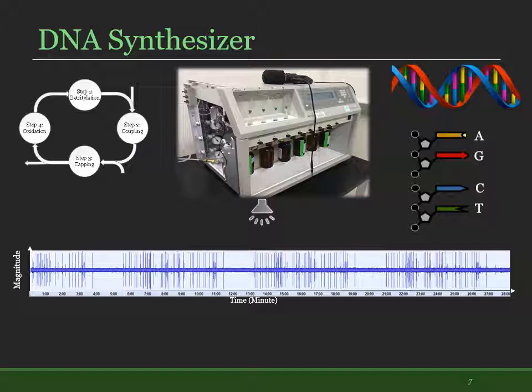Basically, the continuous noise is from the fluids running in the system's pipes, and opening and closing of the solenoid valves causes click-like peaks in the collected signal.